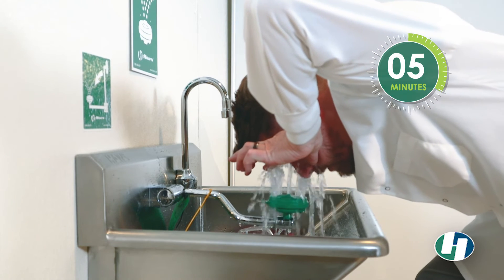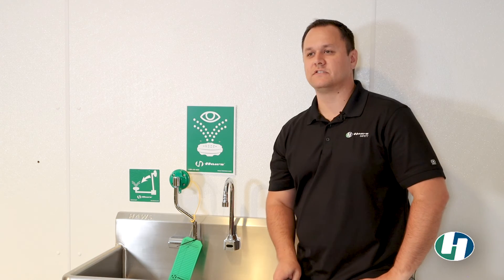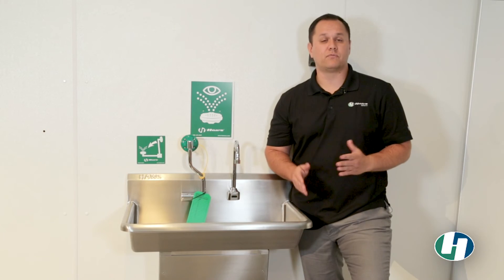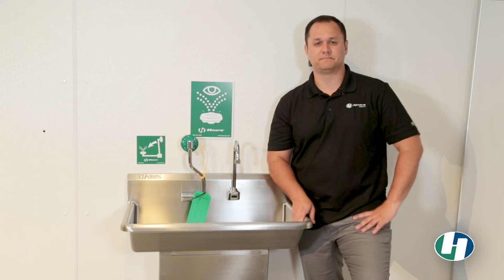Continue using the eye face wash until 15 minutes have passed. Call emergency services when the flushing is complete if it has not already been done for you. Be sure to inform first responders of what you were exposed to right away.